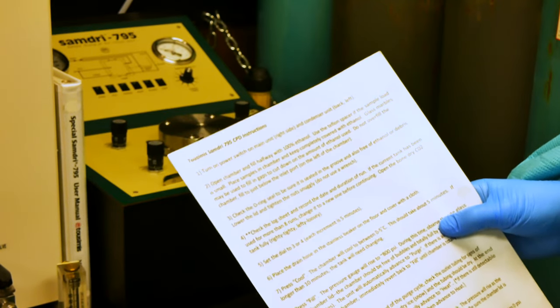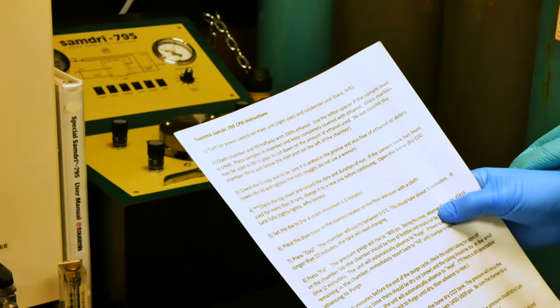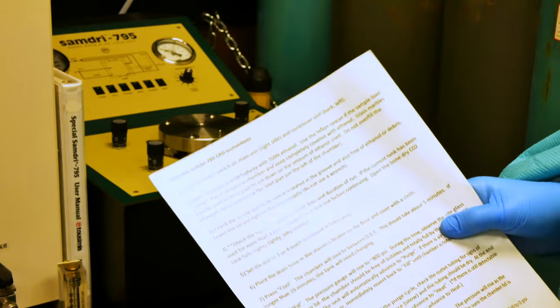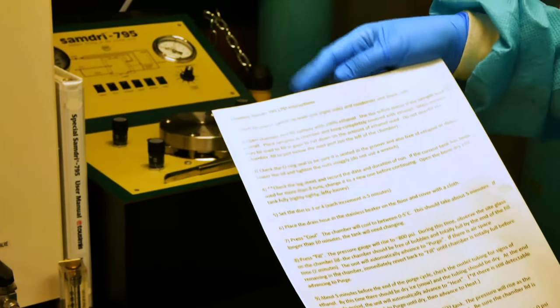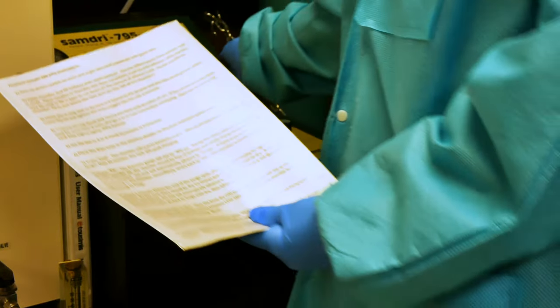Instructions for using the critical point dryer Tousimis machine. We will start with turning the power switch on the main unit on the right side.